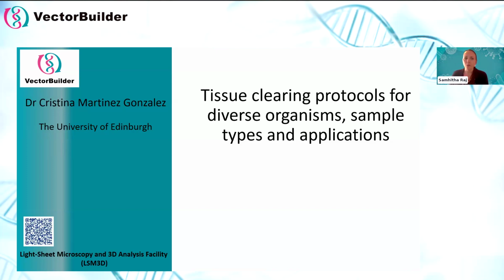Today, Dr. Cristina will present tissue clearing protocols for diverse organisms, sample types, and applications, sharing core principles and practical guidance for choosing the right clearing approach for different samples and to meet your research goals.